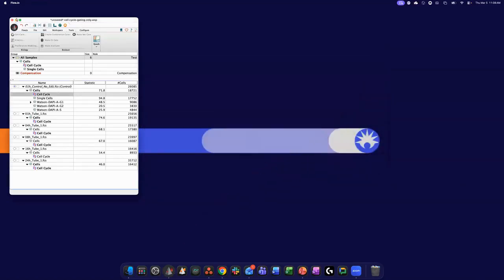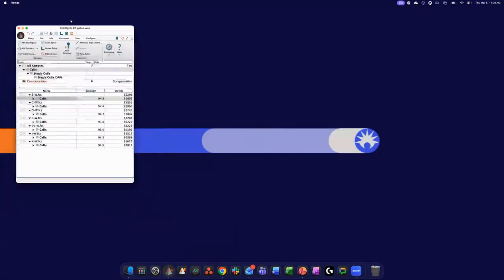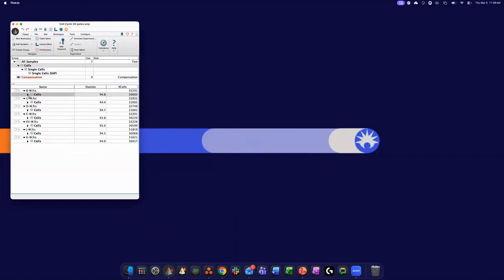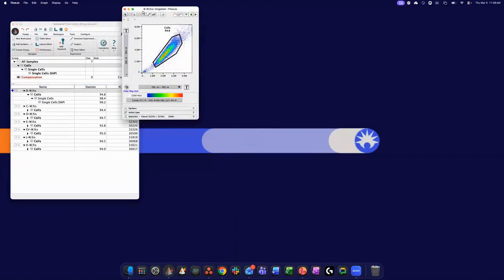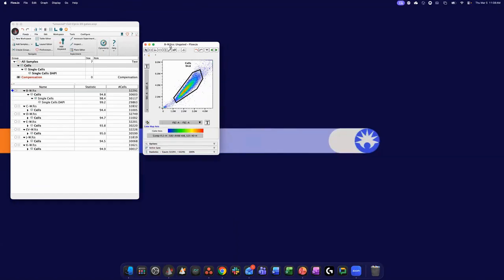So what about the 2D, 3D analysis? Okay, so I do have a data set I can show you that with. Let me just get that workspace opened. Okay, so this is a two-dimensional cell cycle analysis. In this case, what are we working with? We're working with cells that have not only the DAPI, or DNA content dye, but also a nucleoside analog like EdU, so we can look for the synthesis stage.